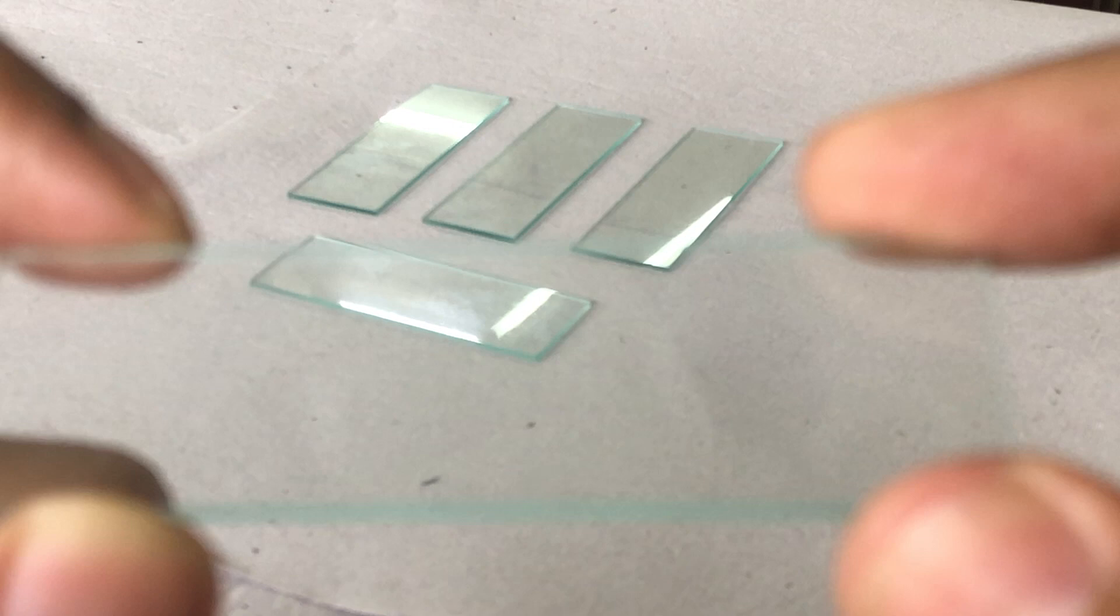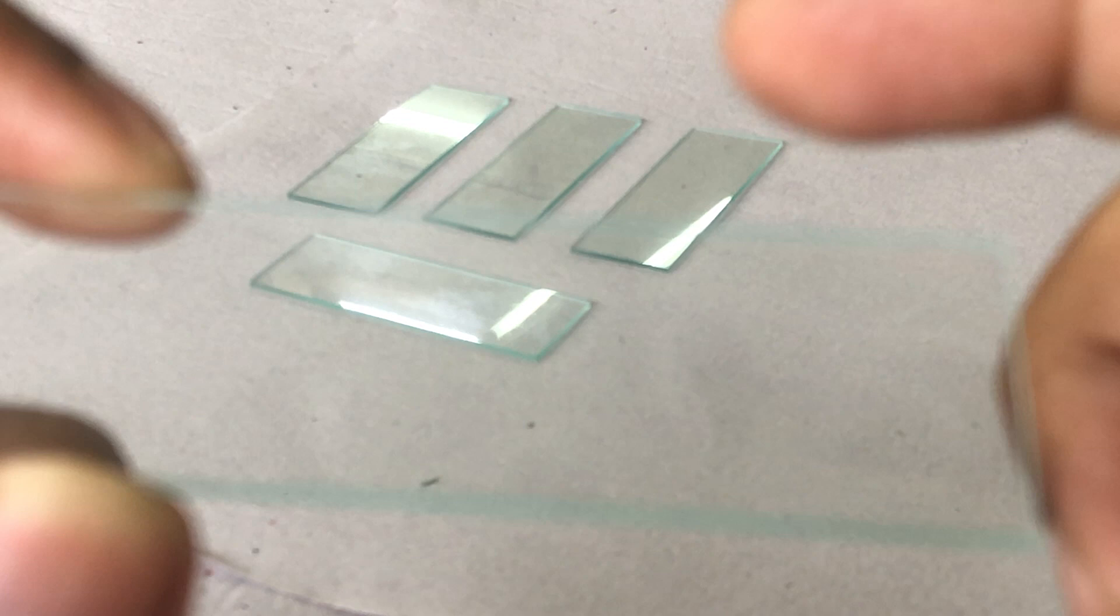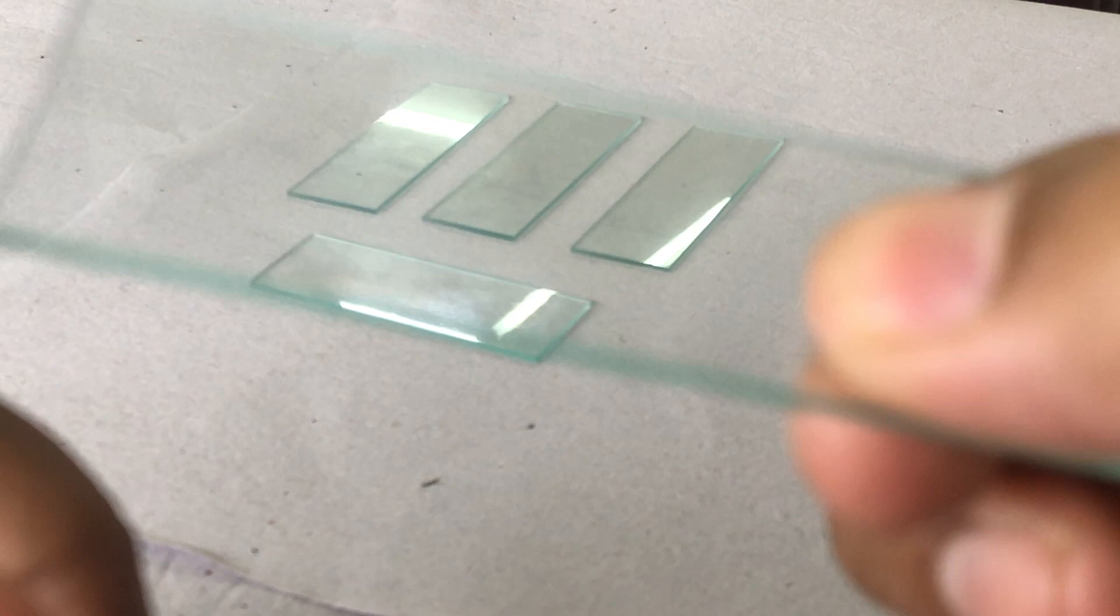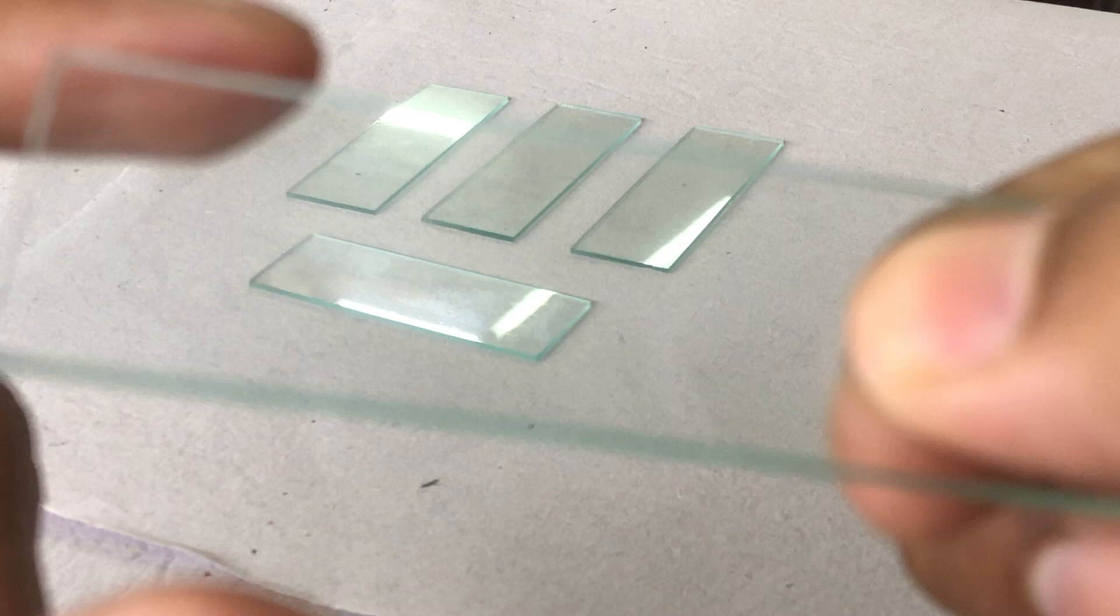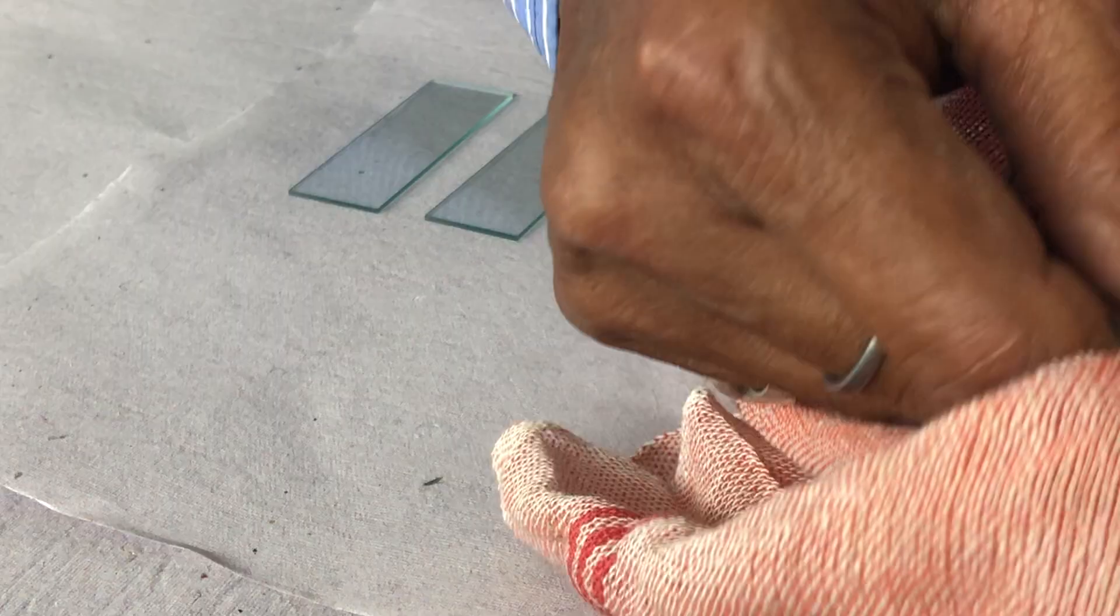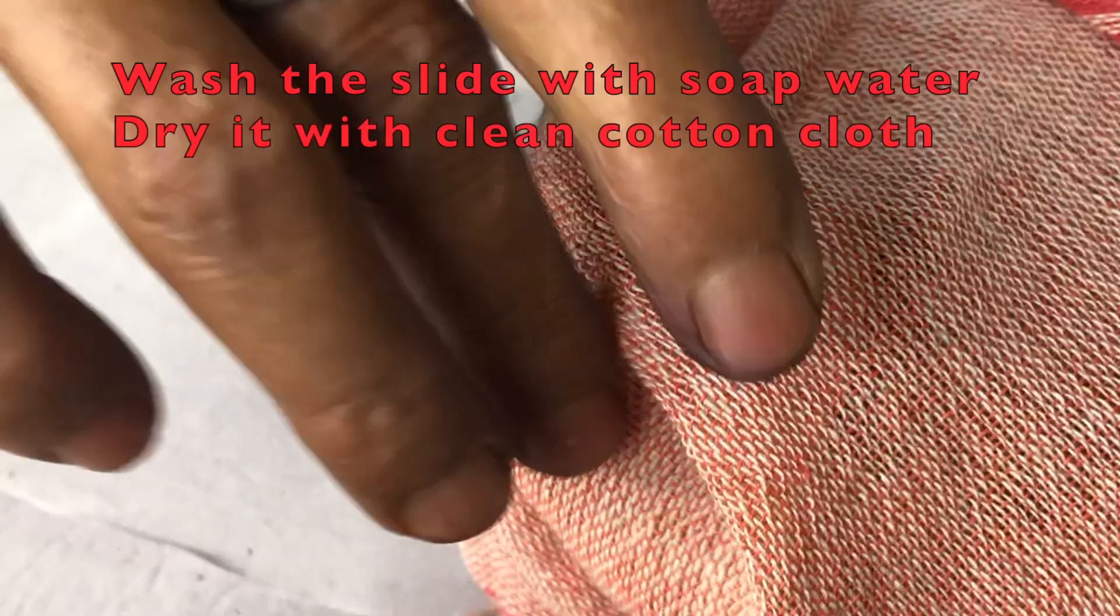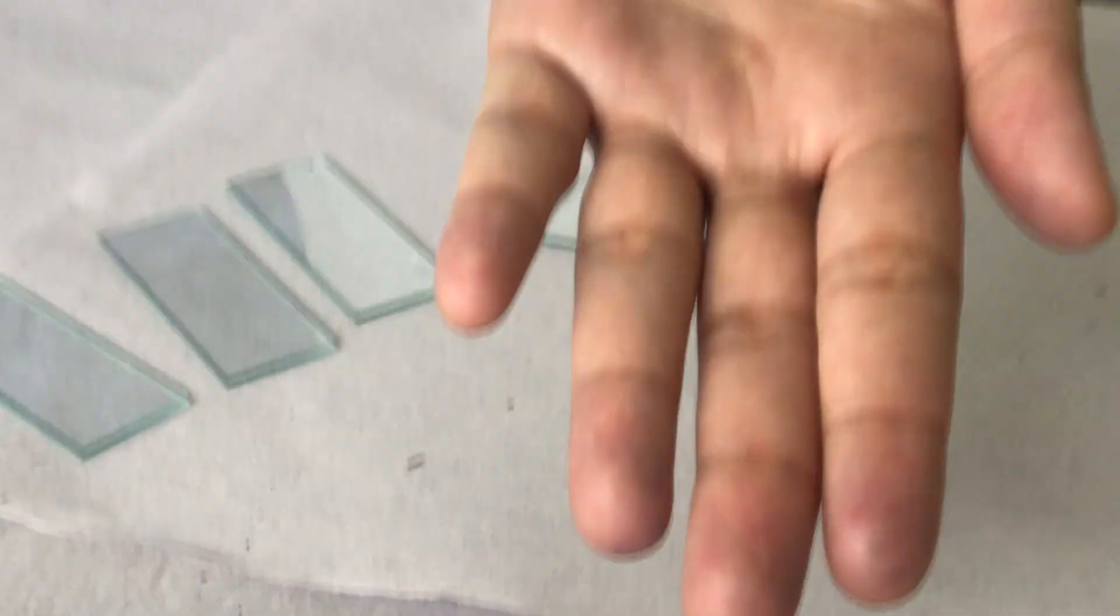When making the smear, we need to ensure that the slide is perfectly clean. There should not be any grease on the slide, and for that you should always hold the slide from the margins. We should never hold the slide from the center because the grease on the fingers gets stuck on the slide, and when the smear is made, then there is a problem in the smear. While cleaning the glass slide, we can use a soft cotton cloth.